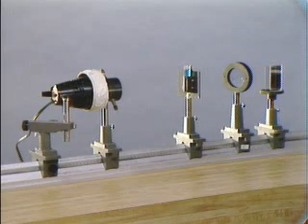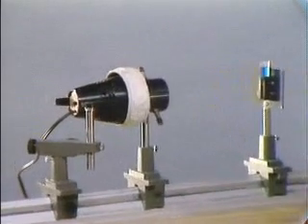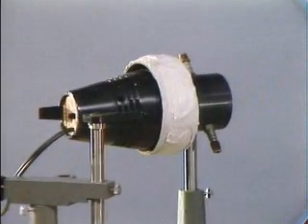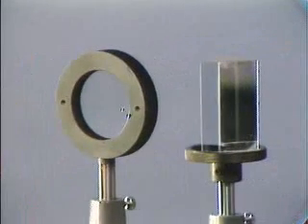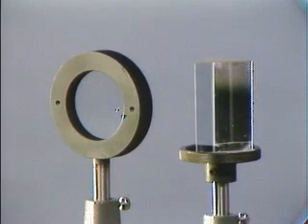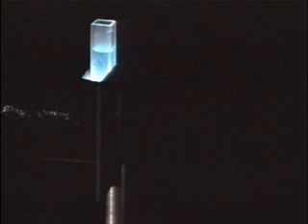Another example of complementary colors can be seen in a demonstration. The equipment consists of a source that generates a light beam, a holder that allows a colored solution to be placed in the light beam or out of the light beam, a prism that disperses the light into its component colors, a lens that can recombine the dispersed light, and a screen on which the light is projected. Before the colored solution is pushed into the holder, the light beam shines directly on the prism, and the familiar spectrum of red, orange, yellow, green, blue, and violet light results.